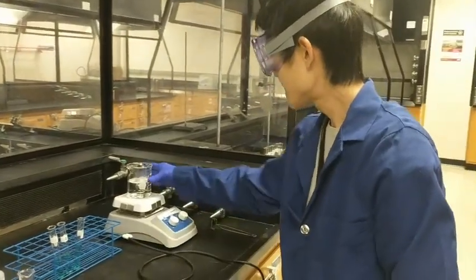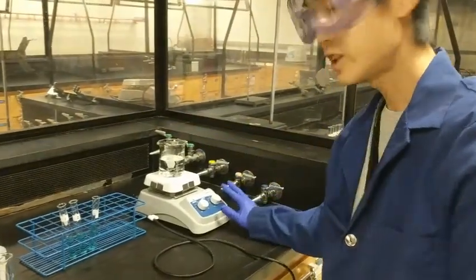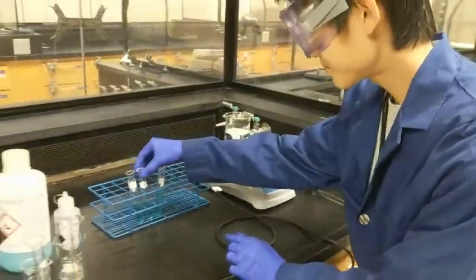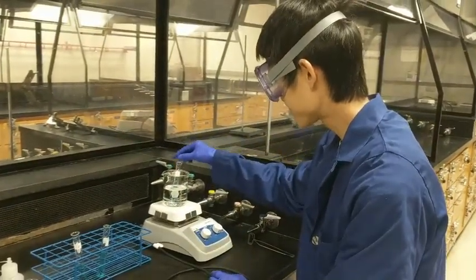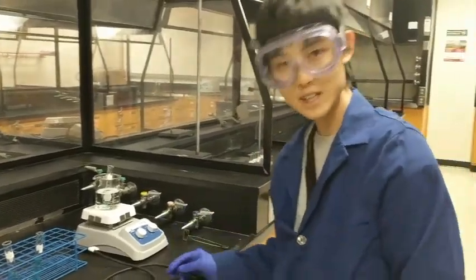So we have some water in a large beaker, and I just turned the heater on to heat it up. We are going to place the second test tube into the hot water bath, and then let's wait for 10 minutes.